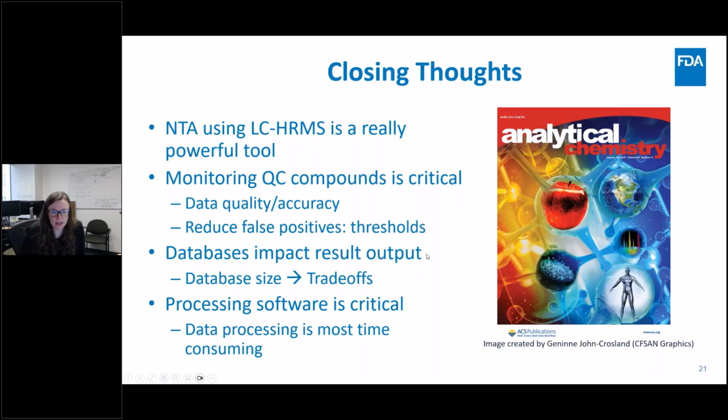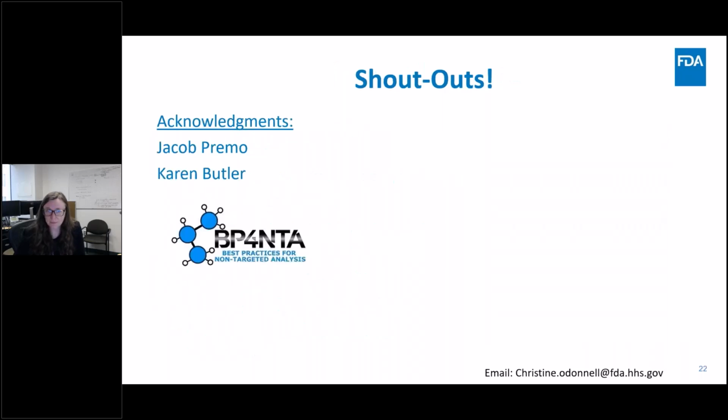And then, of course, processing software is really critical to all of the steps of our workflow. And, as I mentioned on one of the early slides, data processing really is the most time-consuming portion of this work. And so it really helps to have good software, such as the ACDLabs software that I've talked about today, to help us make each of those steps a little bit easier.